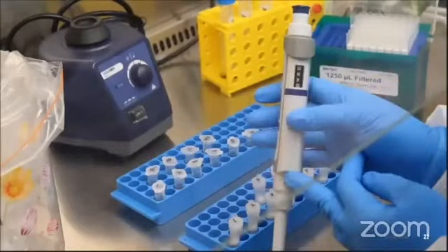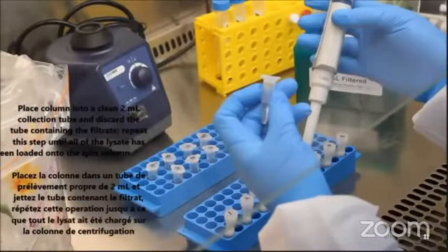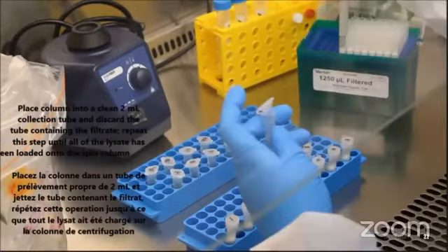We need to repeat this step because we need to complete our lysate.